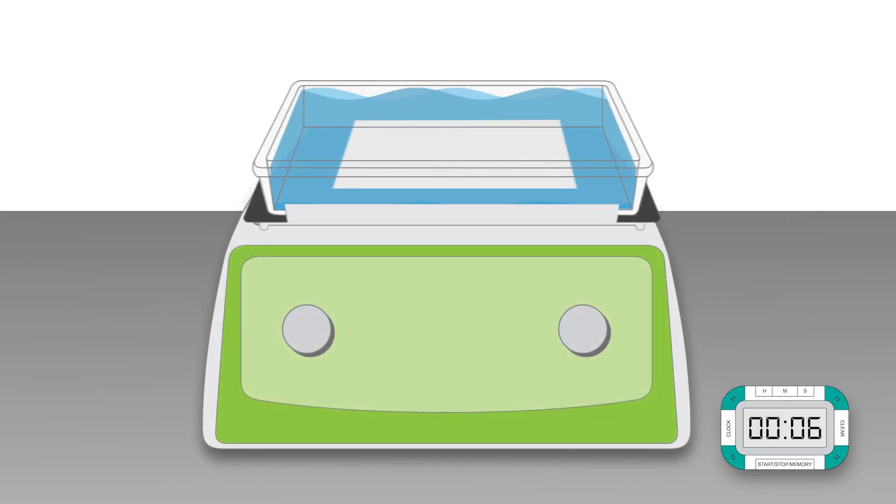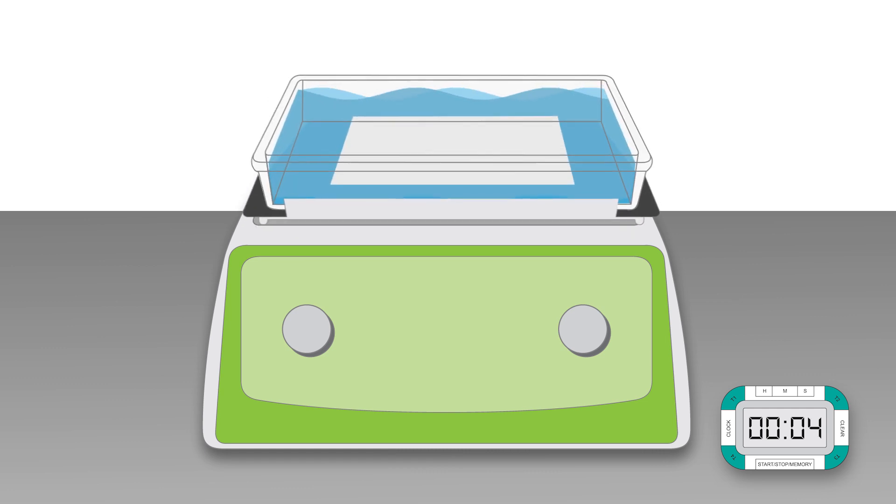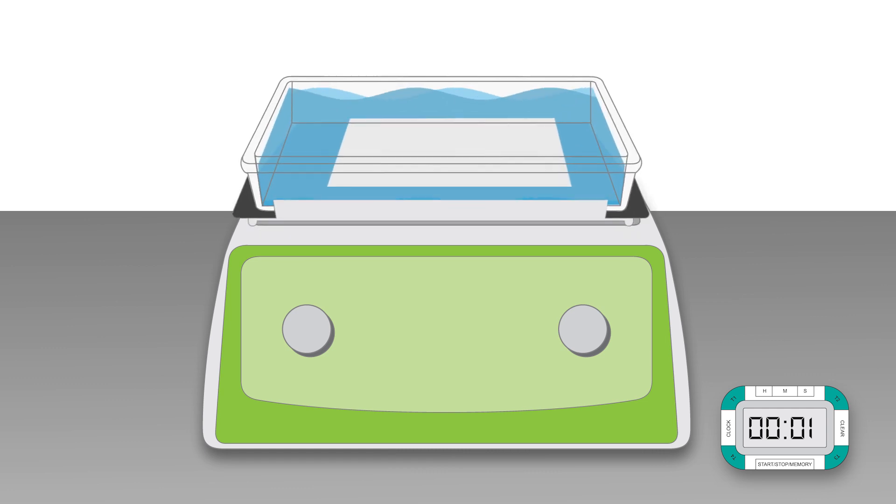Ensure that you are blocking the membrane in a sufficient volume of blocking buffer and that the incubation time is long enough.